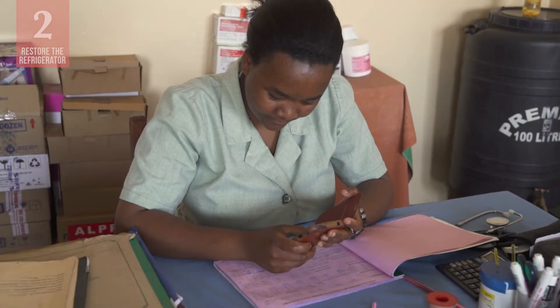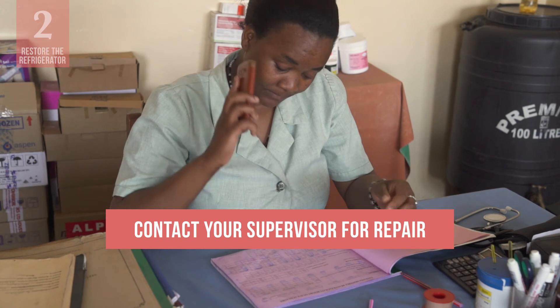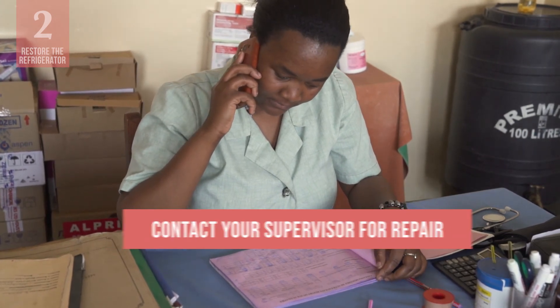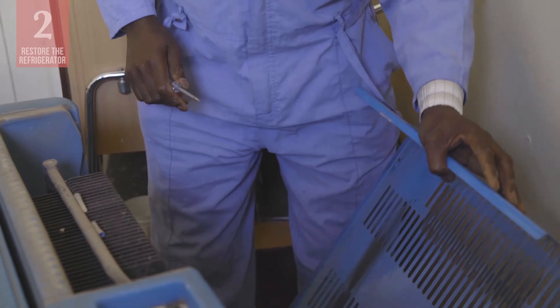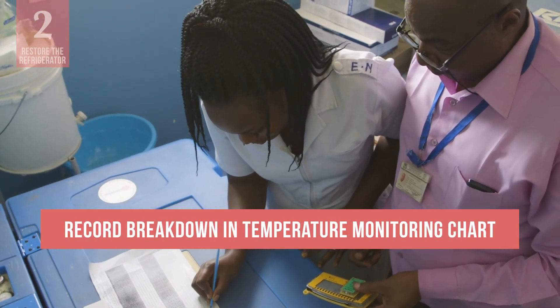If a lack of electricity, gas, kerosene, or solar power is not the problem, contact your supervisor and ask for a repair service visit. Do not attempt to repair the refrigerator yourself, unless the problem is a simple one that you have been trained to deal with. Record the breakdown on the daily temperature monitoring chart.